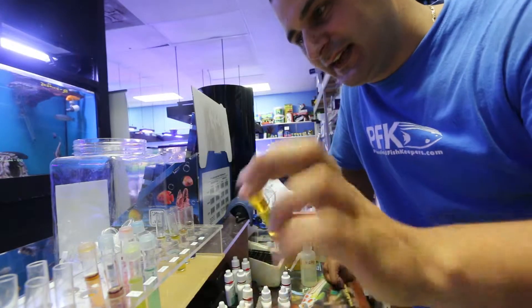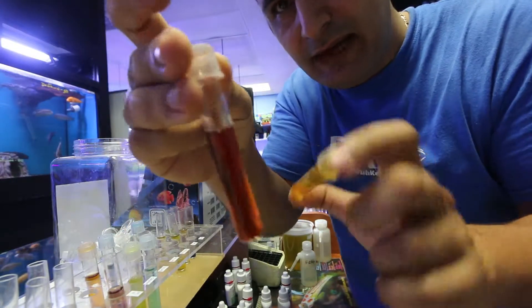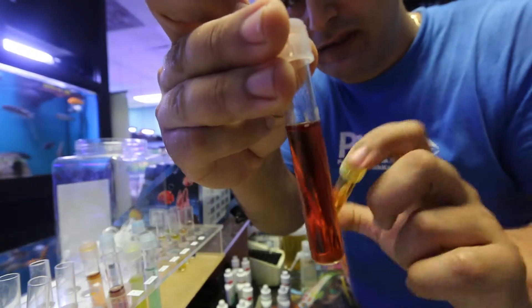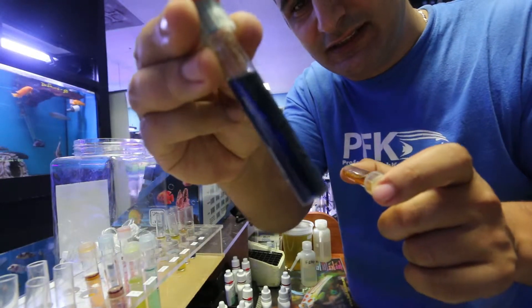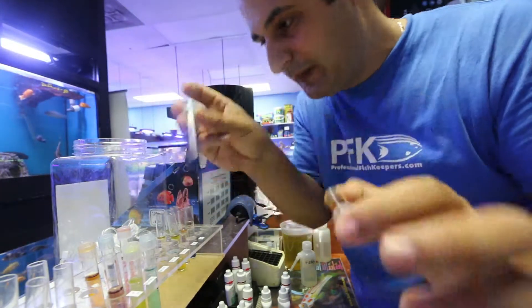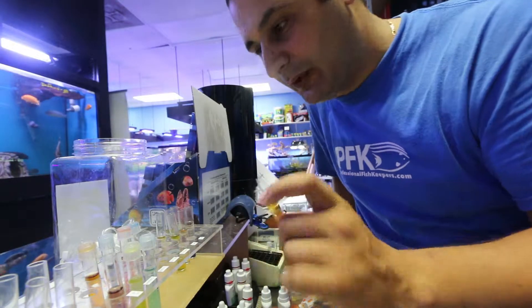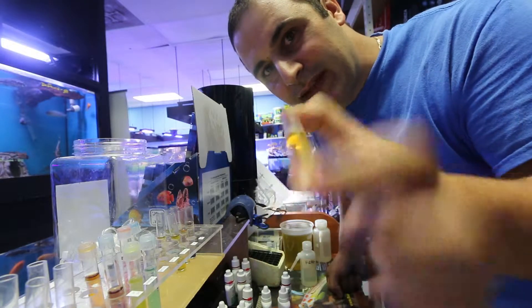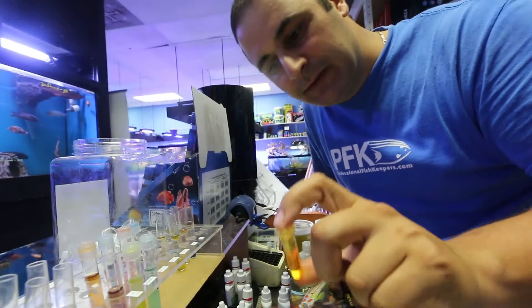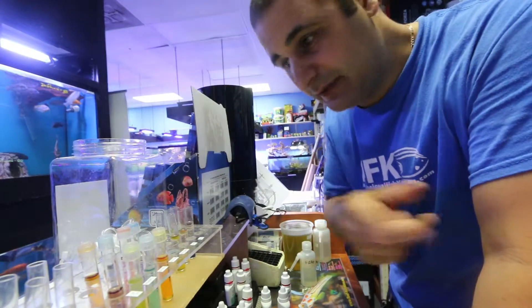This sample here is from a customer I tested yesterday — the result was very bad. His phosphates were also terrible, and he was wondering why his corals were not doing well. You've got to test the water. This tube is already starting to show some coloration, so I'll wait five minutes and then show you how to read the results.